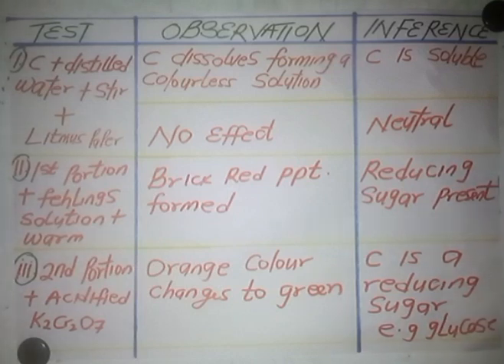From the specimen given, I was able to draw up this question for your revision. This is not to say this is the exact question that you will see, but just for you to have an idea of what you might be facing that day. That's the salt analysis part. The specimen was zinc oxide and glucose.